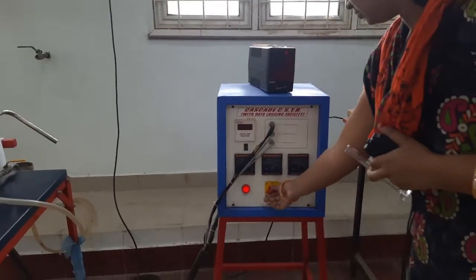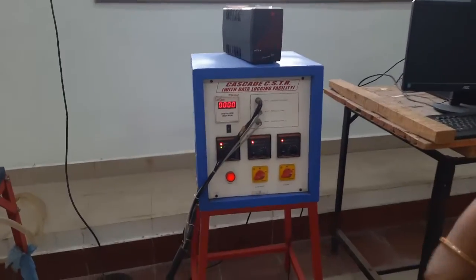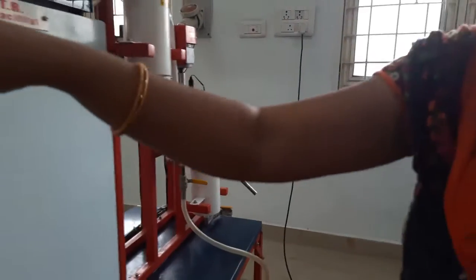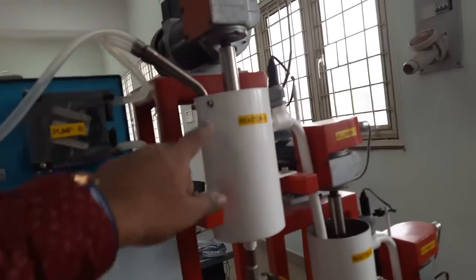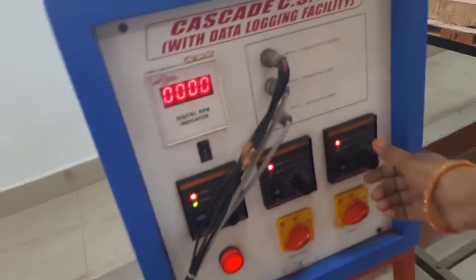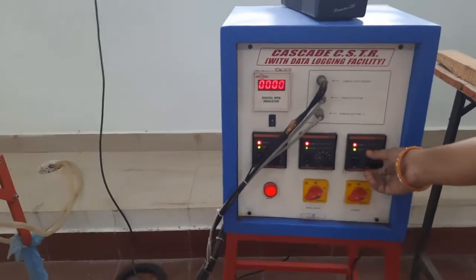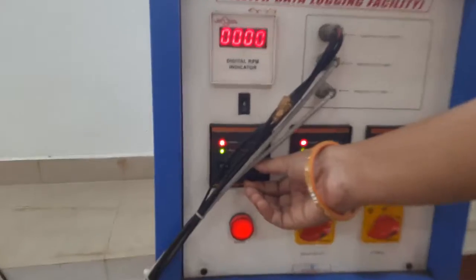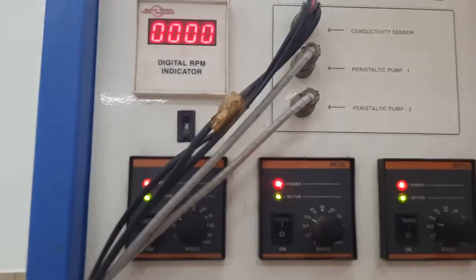We can switch on the motor and we can switch on the stirrer also. Okay, so we have to switch on all the 3 CSTR stirrers also. So for that we will switch on this. Keep the same speed in all the 3 at the same RPM. We have to keep the same speed, 30 speed. This is giving 30%, 30% and 30%. Whatever it is, it should be the same for all the CSTRs.